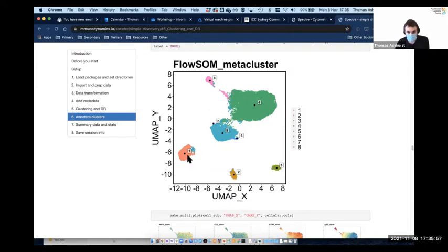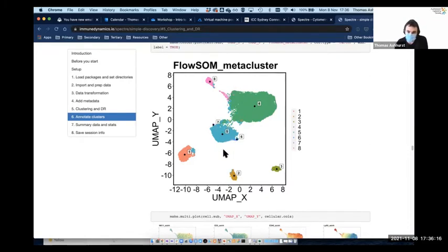The fact that all these cluster 1 cells are near each other, that's meaningful. The fact that all these cluster 8 cells are near each other, that's meaningful. The fact that these two have a lot of distance between them is not meaningful. That overall arrangement is a compromise for how we can get this data into 2 dimensions. So it's important to remember that, because otherwise we can start to make some biological interpretations where it may not be appropriate to do so.